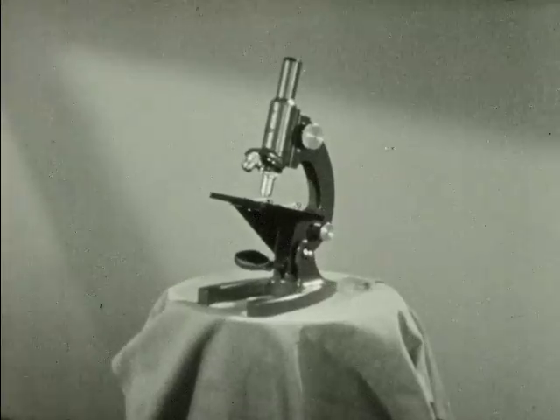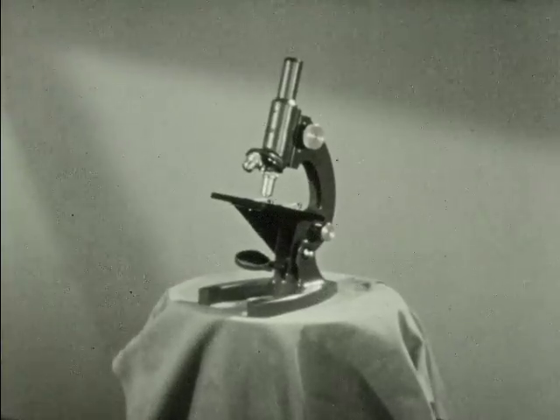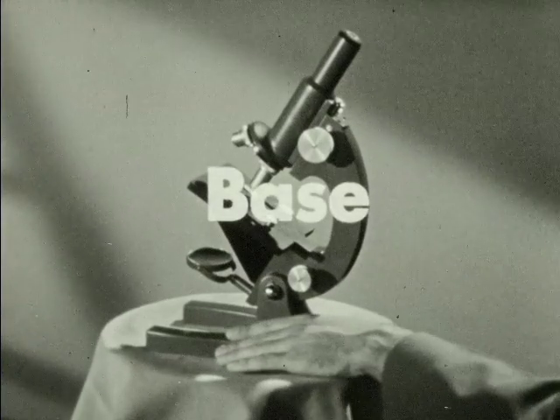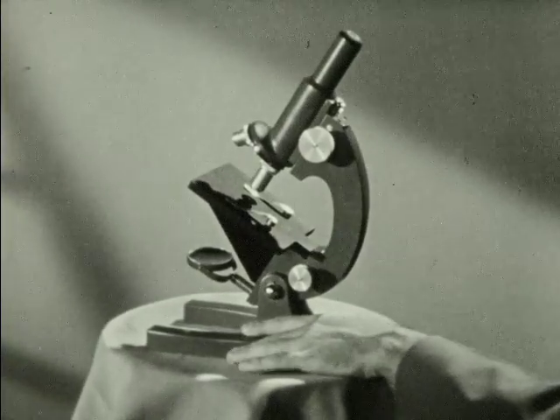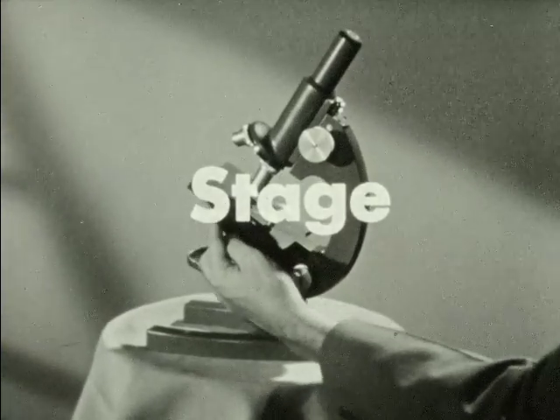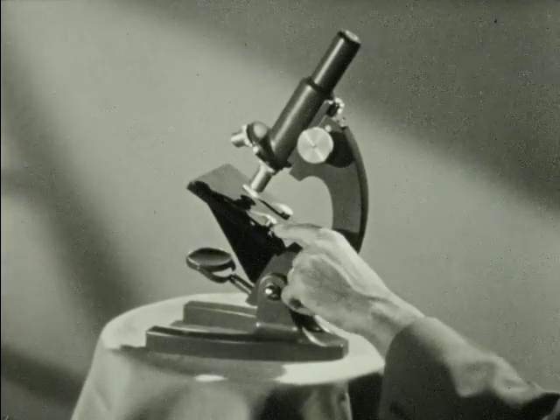As the first step in learning to use the microscope, we must become familiar with the names of the main parts of the standard instrument. The base is so named because it supports the microscope. It is fairly heavy to make the instrument stable. The stage may be compared to the stage of a theater. It holds the specimen to be viewed, and therefore is where the action takes place.